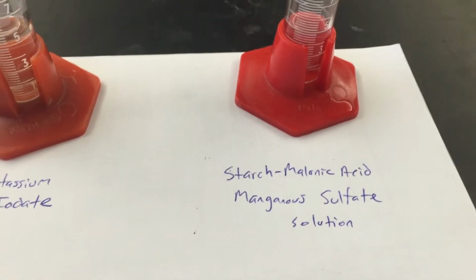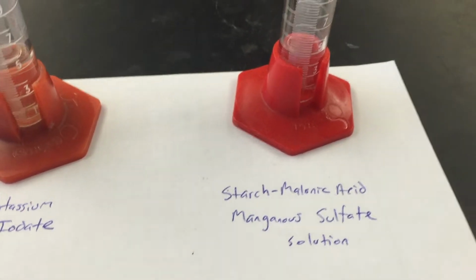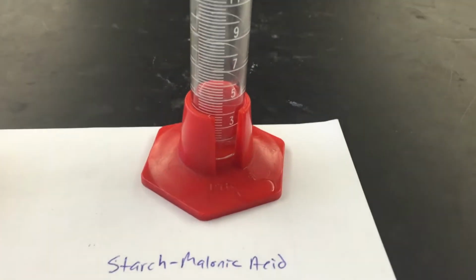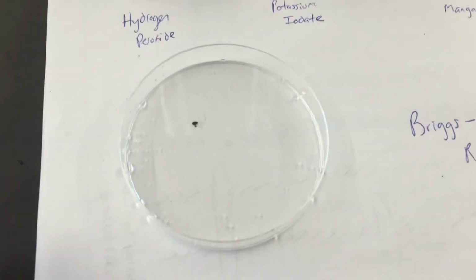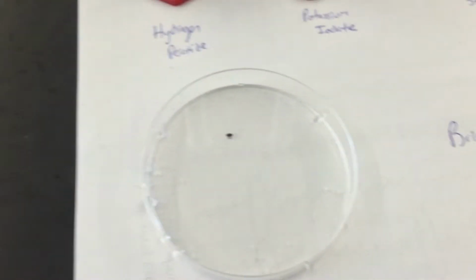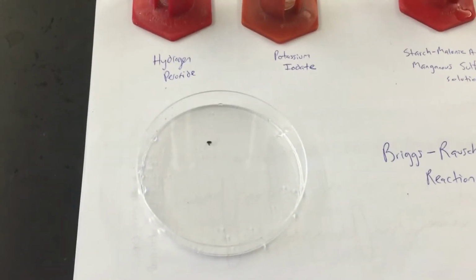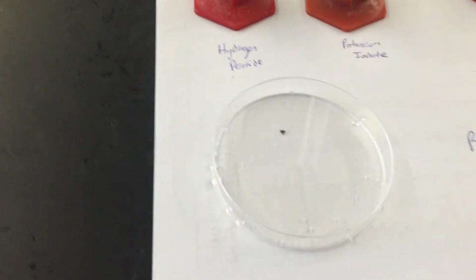I have probably the longest name you'll ever see: starch, malonic acid, manganese sulfate solution, also acidified. And all of those are pretty much clear, with the exception of potassium iodate, which is a little bit yellow. What I'm going to do is mix them in this petri dish and observe what happens as a result. Now, there are actually two reactions happening in this reaction, but the effects are kind of cool.